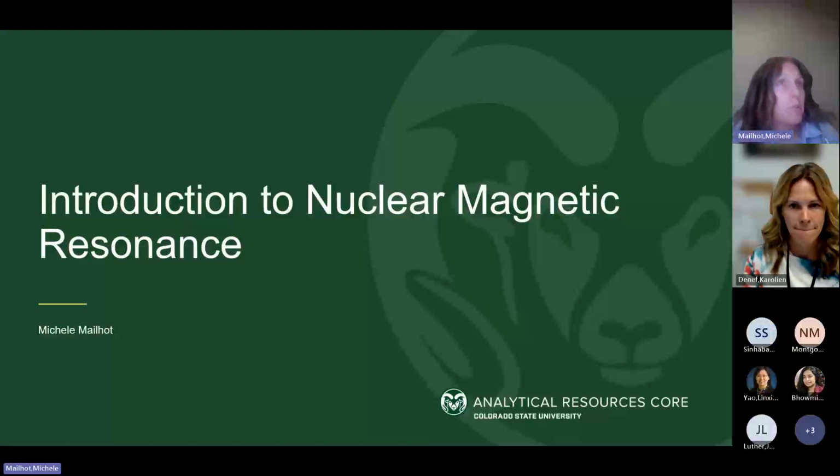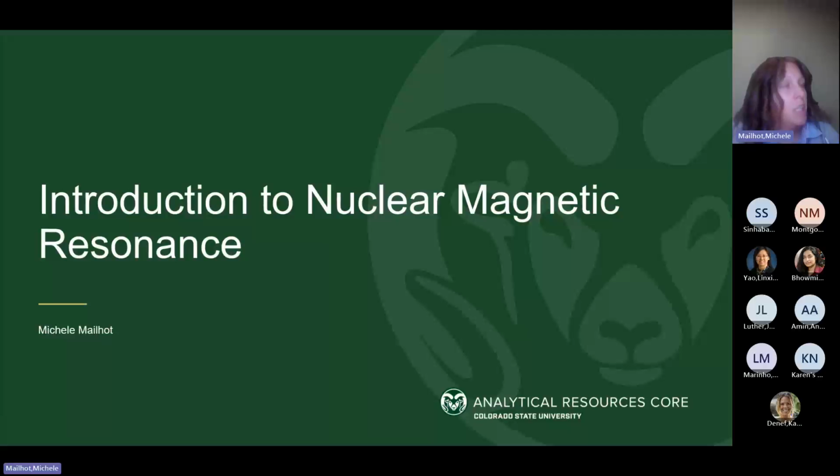I'm just going to talk a little bit about an introduction to NMR. We'll go through a little bit of theory, not much, and then some practical applications, and then what the ARC has, and then kind of what the future will be for NMR here.